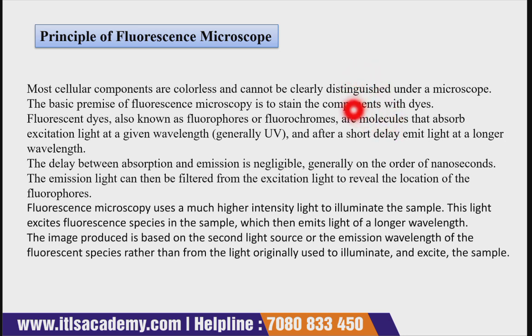What kind of molecules? Molecules that absorb excitation light at a given wavelength, generally UV, and after a very short delay emit light at a longer wavelength.